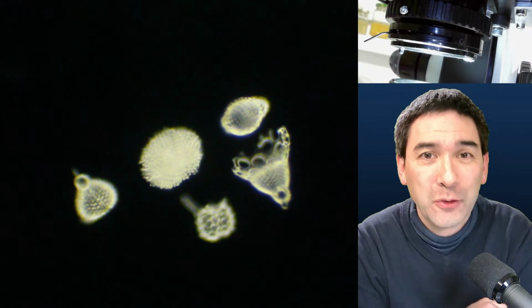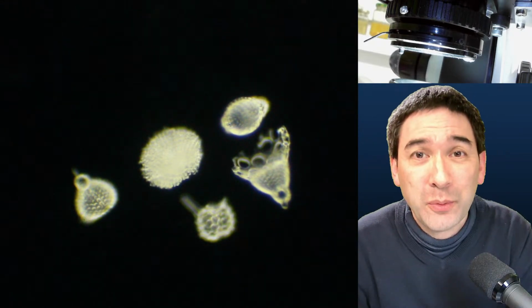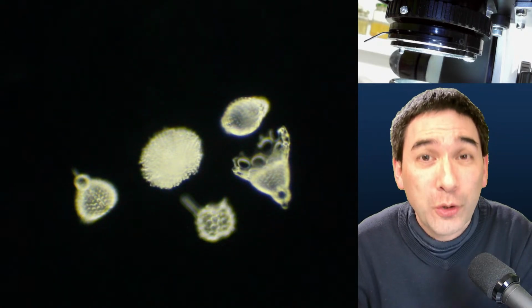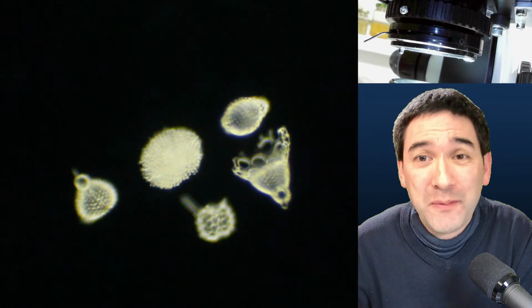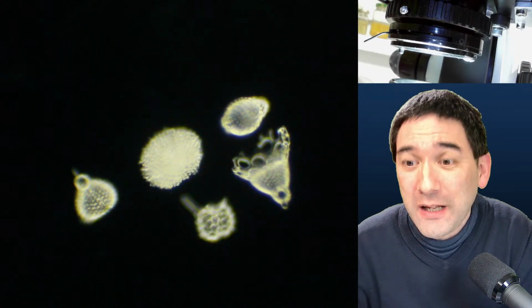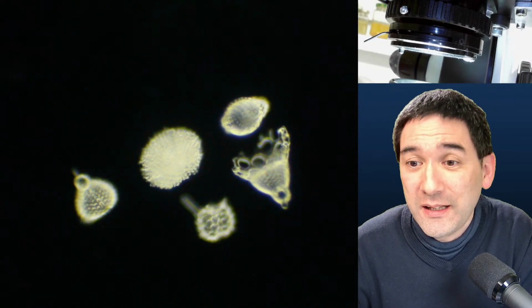It's a little bit difficult to understand here, but I would also like to try a little bit of oblique illumination and dark field microscopy. So that's the loose topic that I have for today.